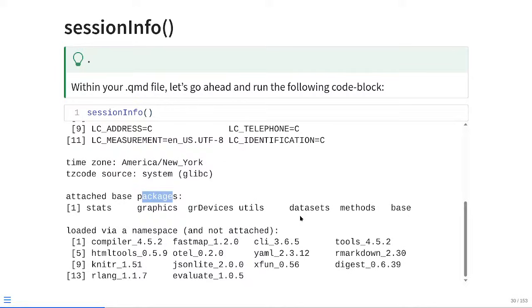And then because I'm working in Positron, Positron also has a few packages it keeps ready in reserve in case you're trying to do something. In this case, you'll see these are not attached, meaning your computer is not able to use them directly. However, they are in a category that's called loaded as a namespace. So your computer is aware that these packages exist, but it doesn't know what the contents of the packages are as far as the functions or the tools that are present inside.